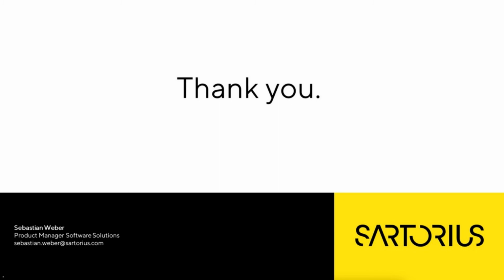Great, thank you, Peter. This next question asks, how can I make sure that the PDF documents have not been manipulated? Okay, that's an interesting one. Anytime you send data to another location, it's always going to generate a checksum file or an MD5 file, which is basically a file generated algorithm.